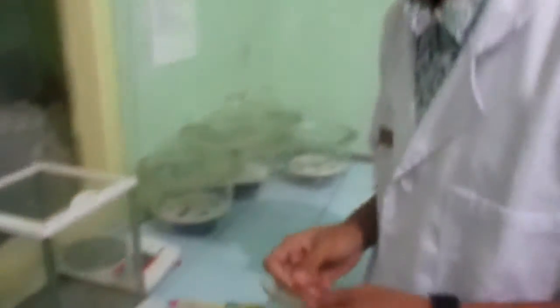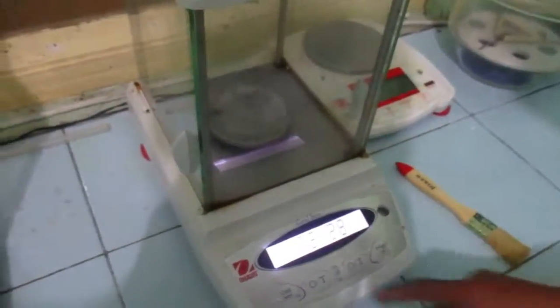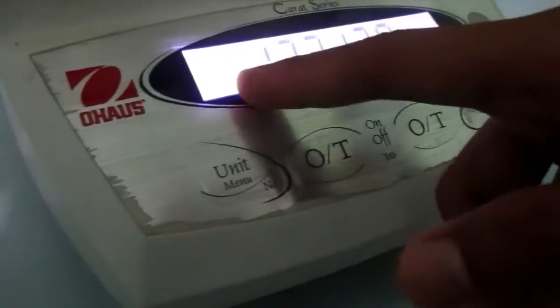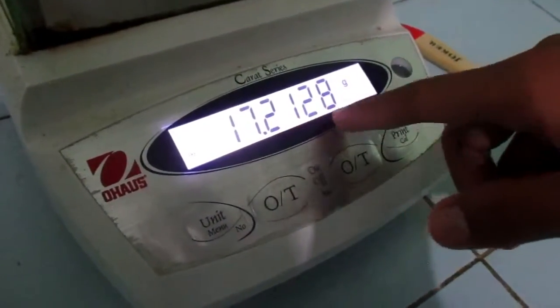The watch glass acts as a container for the chemical solid. Before we weigh the chemical solid, we have to weigh the watch glass first. Open the glass door and place the watch glass in. Wait for the balance to stabilize — once the star indicator appears, the balance is stabilized. We get the number 17.2128 grams.